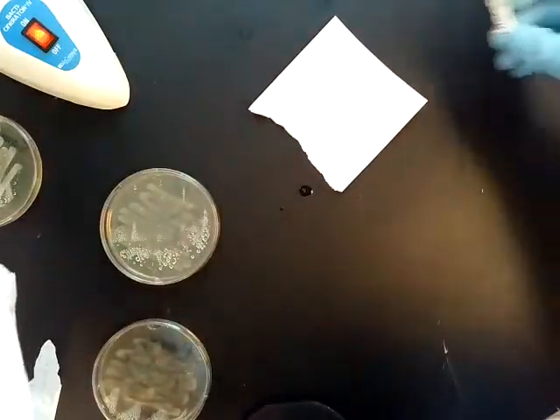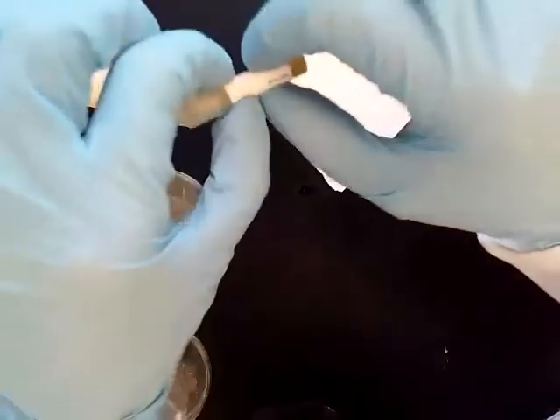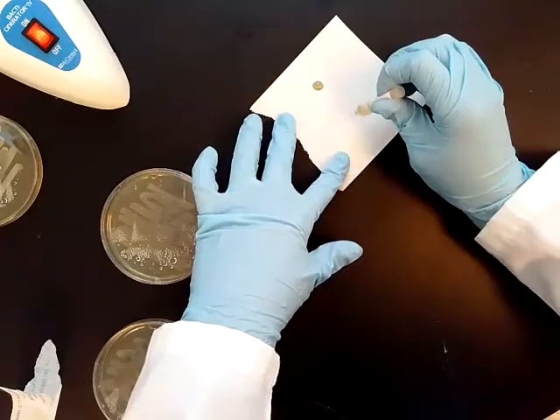Then you're going to grab this dropper, the DMACA indole dropper. There is a glass ampule in here that you'll have to break, and then you'll have to shake it down in order to use it. When you put the drops on the paper, you should see a color change.